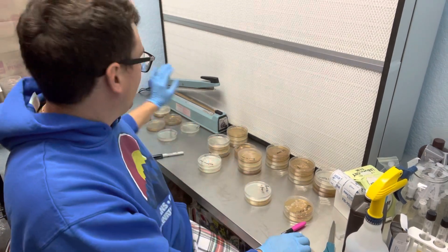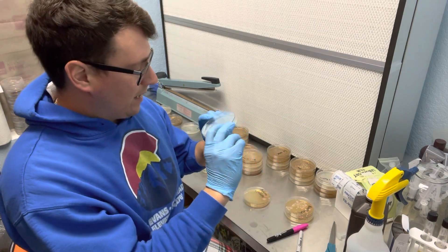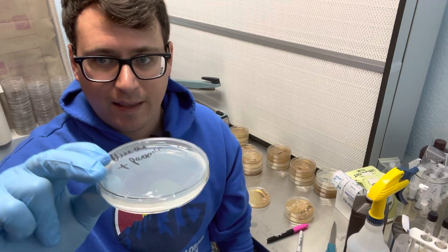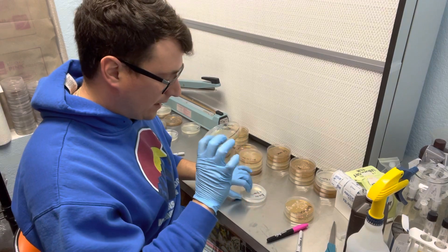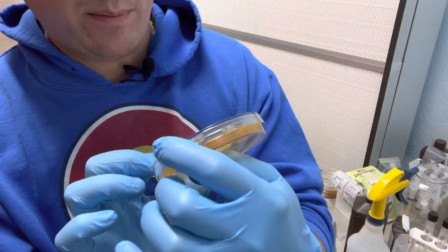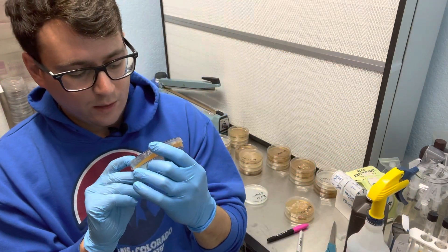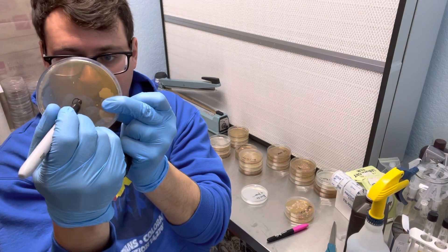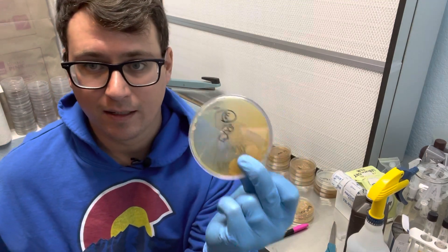I've got some clean ones over here as a backup, so I'm pretty confident we'll get some results from those. This will be more challenging. These are those same PDA plates that were contaminated after a couple days of soaking in peroxide. The idea is that the peroxide will destroy the bacteria but allow for mycelium growth. This is the blue oyster plate with peroxide on MEA — you can see some of the bacteria survived that initial peroxide wash, but it does look like we're seeing some other growth towards the middle of the plate. So I'll label these colonies as well, just in case we get some more blue oyster growth that we can save from potentially contaminated plates.